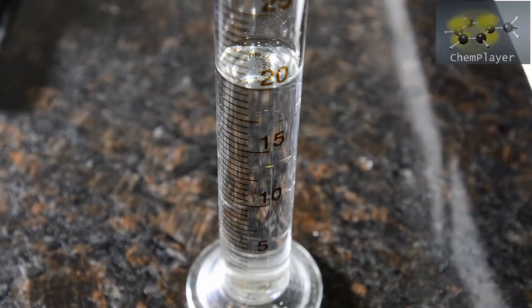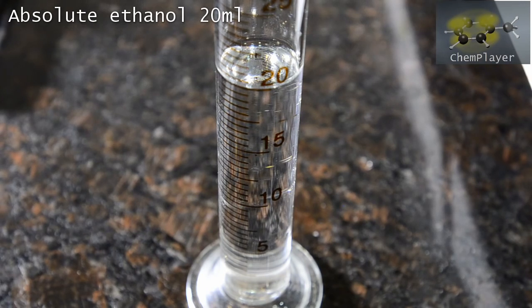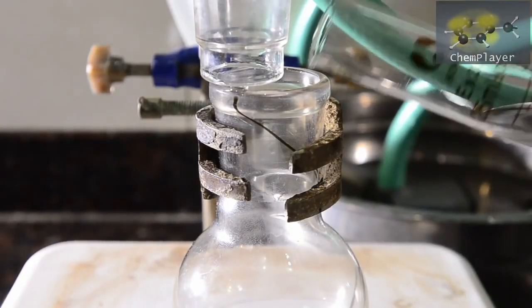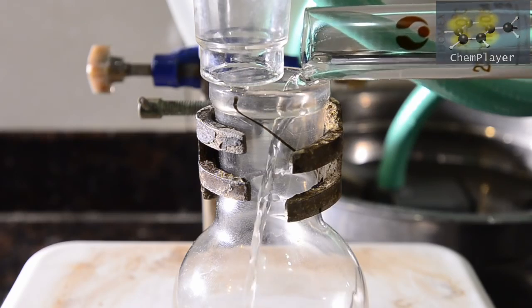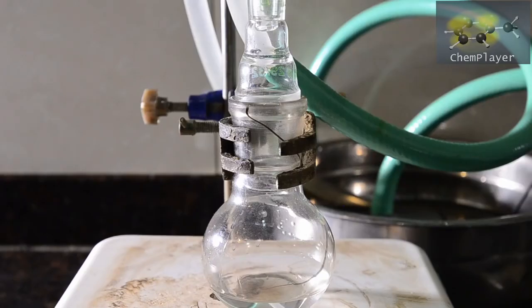Let's get going. First we've measured out 20 ml of absolute ethanol into a dry measuring cylinder. Again, the ethanol must be anhydrous for this reaction to work. With the condenser temporarily removed, we add this into the flask. Okay, here we go. We've closed it back up again to ensure that no moisture gets in.